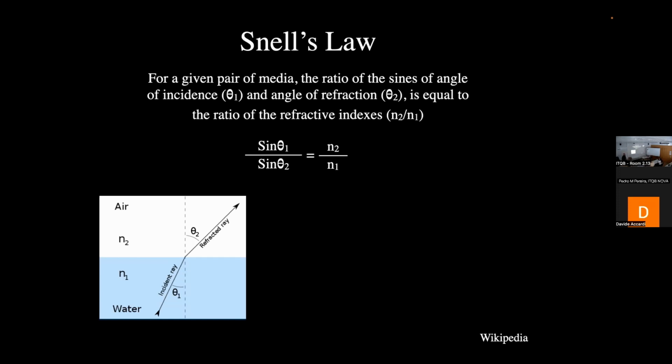So in that example, the refractive index is always bigger than 1, right? Yes. Shouldn't theoretically the refraction always be outward? If light is passing from a denser medium to air, yes. Or from a denser medium to any other medium that has a lower density, so a smaller refractive index, the bending is always outwards with respect to the normal. If you are passing from a less dense medium to a denser medium, from glycerol to glass, for example, say your mounting medium of samples is glycerol based, and glycerol is less dense than glass, and you have your cover slip on top, then in that case it will bend inwards.